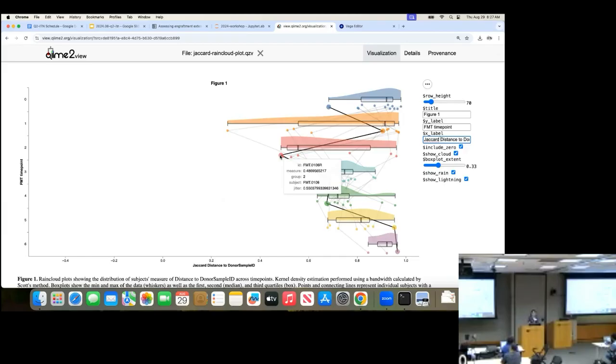And we're not getting into this right now, but we have just enabled this to be able to facet by groups. So say you have 2 treatment groups, like the study we were looking at in my presentation, they had short-term survivors and long-term survivors, and they wanted to make sure the engraftment was the same across both.